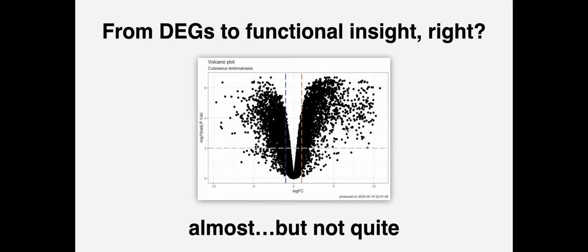And so it's another important thing for you to recognize. We only have one possible comparison, disease versus healthy. But the norm now is to actually have far more comparisons that are made in a single RNA-seq experiment even. You might have multiple treatments or time points, in which case you would have multiple volcano plots like this, and therefore multiple modules that could be pulled out by way of a clustering analysis. In our case, we can only have two modules, genes that are turned up and genes that are turned down.